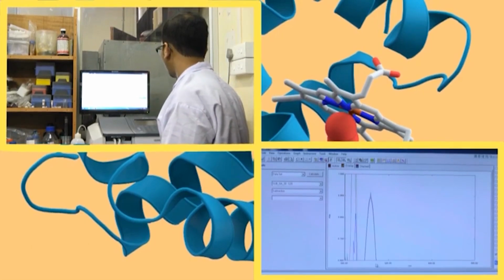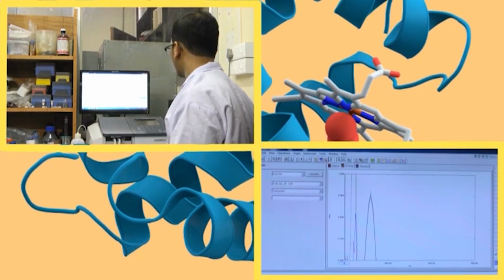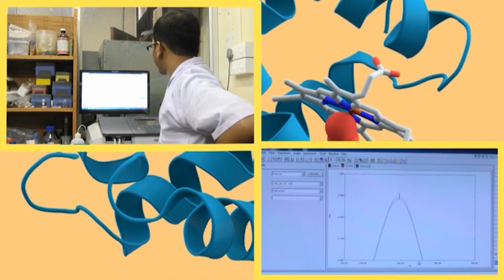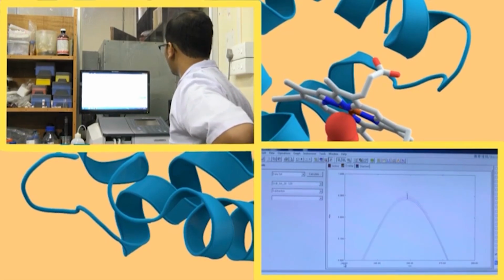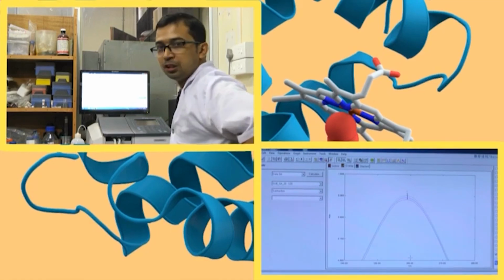Okay. So, it is not clear to that extent. Let us change this one to 30 and this one to 300. Or let us say this one as 280 and this one as 240. So, this is the region where the change is occurring around 260.